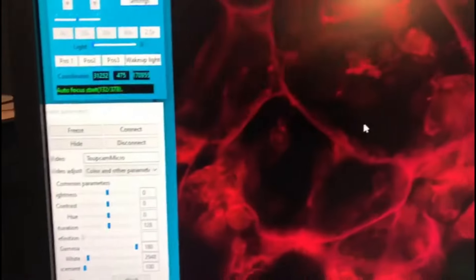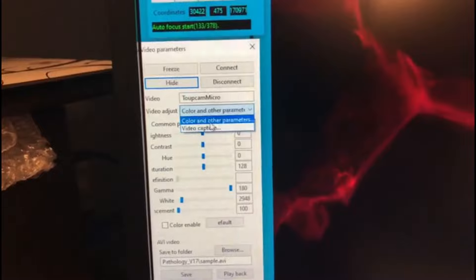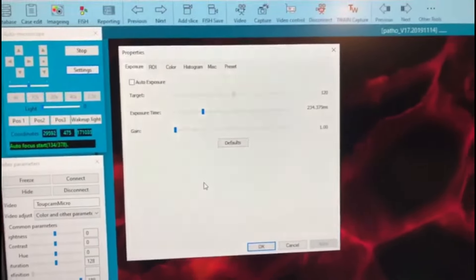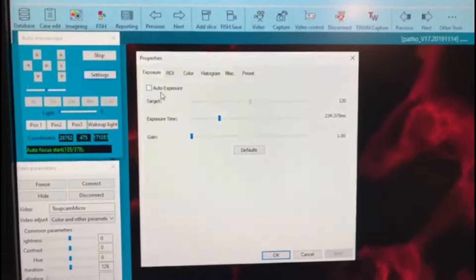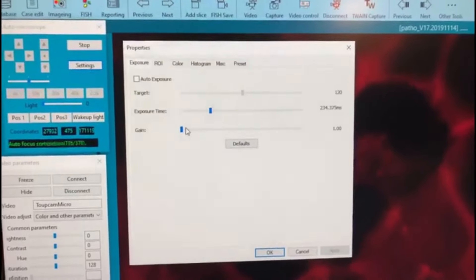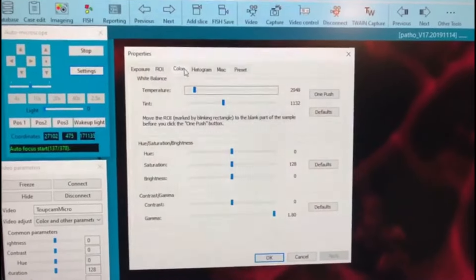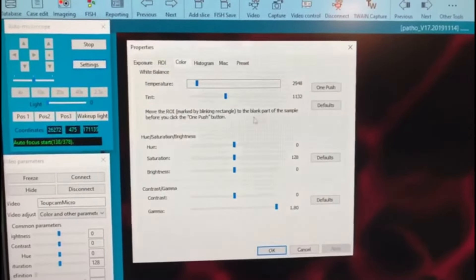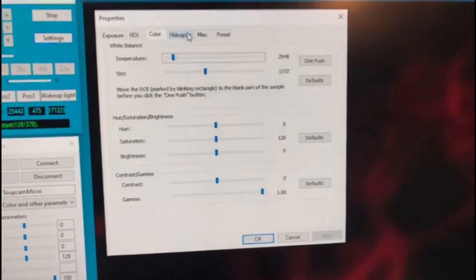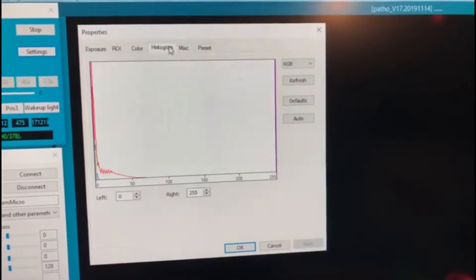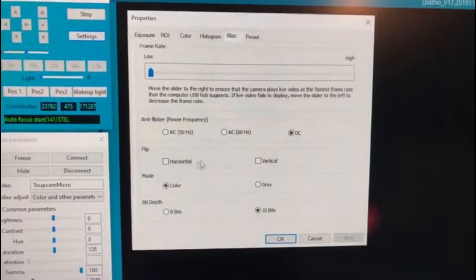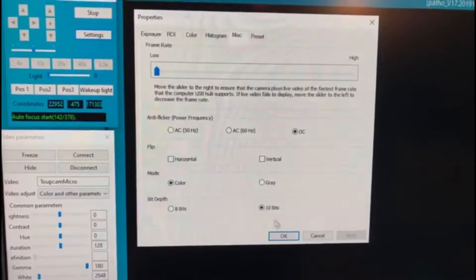Coming back to the camera settings while the experiment is running. We are in manual exposure mode, collecting at 235 milliseconds. The gain is at the minimum, which is just one. White balance was done, then we changed gamma to the maximum of 1.8. The histogram is left in default after mode. We are collecting the image in color mode, TIFF format, and it is 10-bit.